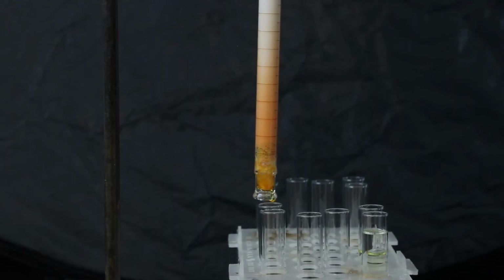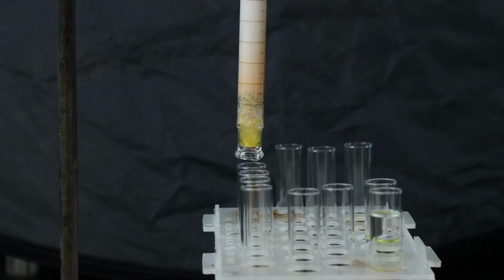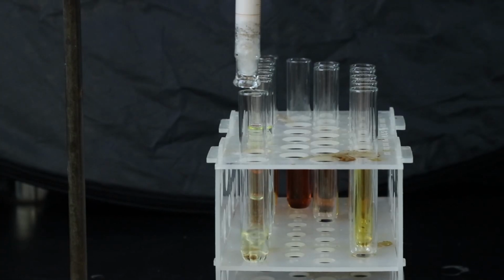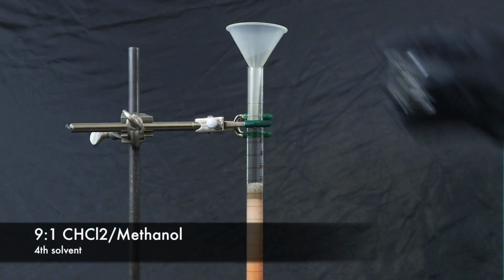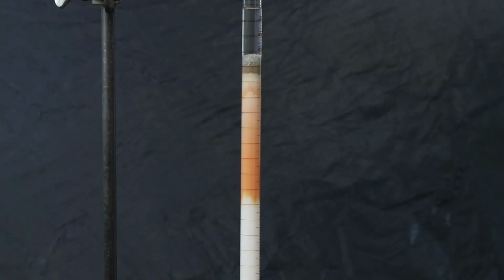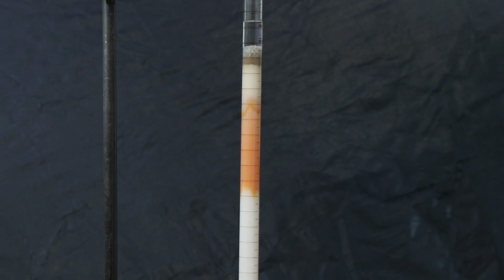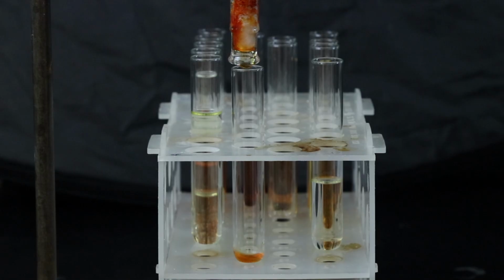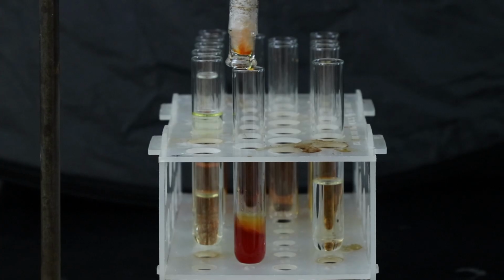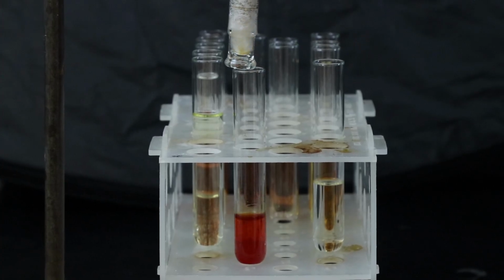So now I'll just basically be doing this until the solvent that is coming out of the column is just clear, like shown here. But now we are ready for the fourth and final solvent, which is the 9:1 methylene chloride methanol solution, which, as you can see, moves the dye product pretty quickly through the column and is why we wanted to have the monoproduct pretty much removed before adding it. Eventually it'll start coming out of the column, and we'll keep pushing the solvent through until what's coming out is no longer colored and just clear.